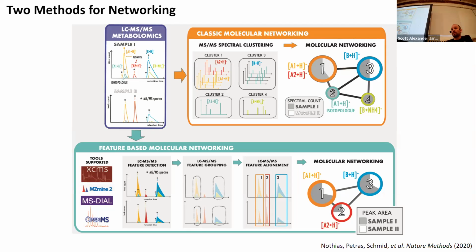If you have a very simple question, often in natural product research, we do not have complicated treatment groups, and we don't need to figure out 5% differences in metabolite levels, then maybe classic molecular networking is good enough. And to me, as a general check of my data, when it comes from the machine and I want to just see, does that look good? Do I ID anything out of it?